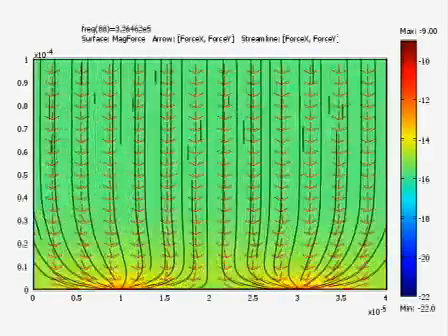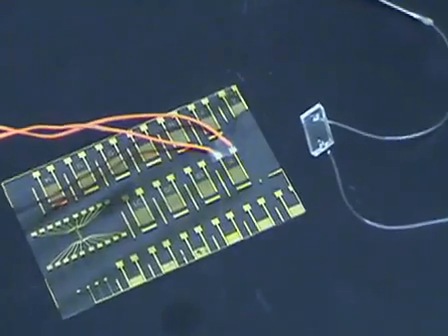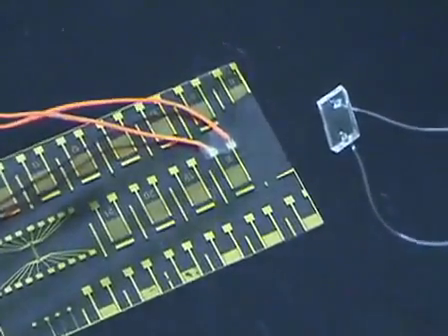In the last several years, the lab-on-a-chip community has embraced an exciting technology known as AC electrokinetics. This group of phenomena can be used to manipulate particles and fluids in the micron to nanometer scale in rapid and versatile ways, and is quickly becoming essential for many biochip applications.